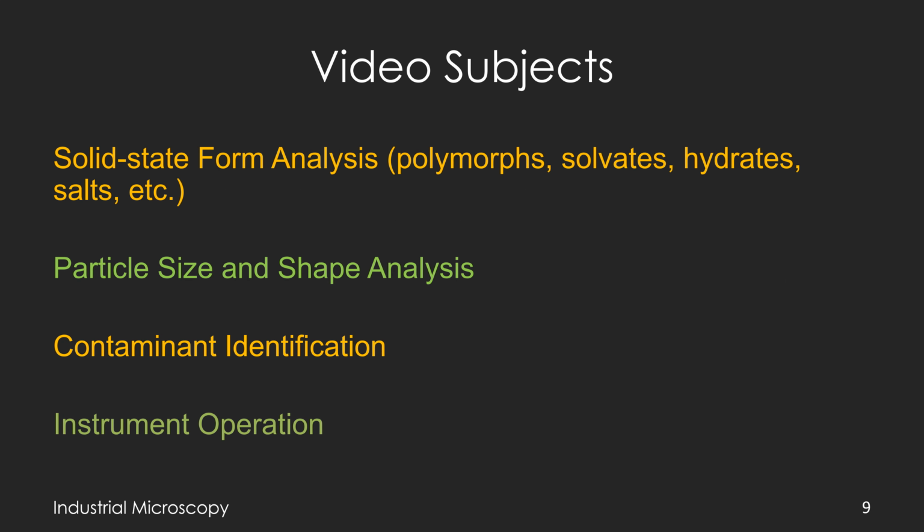The subjects I'm going to cover are solid state form analysis, in other words, looking at polymorphs, solvates, hydrates, particle size and shape, and contaminant identification, which I think is one of the most important things that an analyst can do within the company. And then I have a number of videos on actually how to set up and use the instruments.